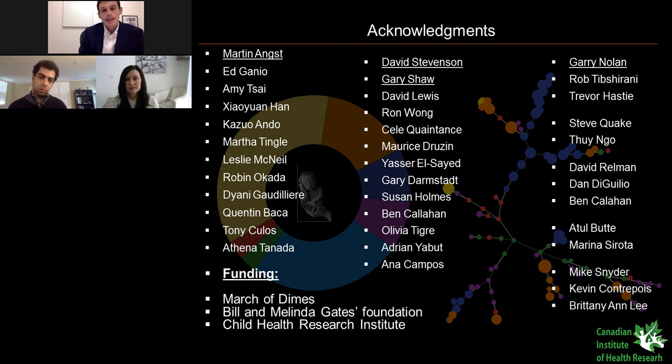And then lastly, and this is very pertinent to the type of global collaborations that we have now, is the feasibility and the fact that the system that we're using, the SmartTube system, is very exportable. When we had to determine what assay to use, we wanted something that we can standardize and replicate fairly, to the letter, the assay that we're using here at Stanford and replicate that in Bangladesh and Tanzania, for example. We wanted something that's very robust and easily implementable. And so here there's 4 simple steps.